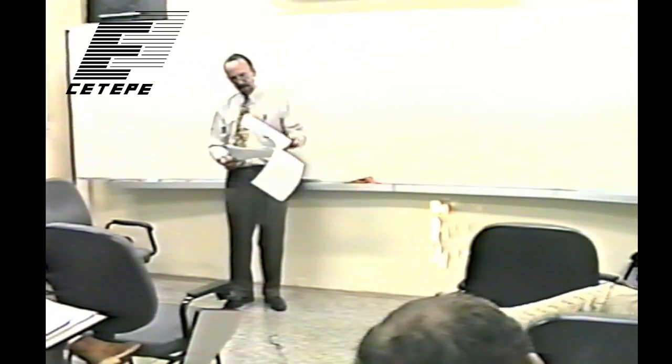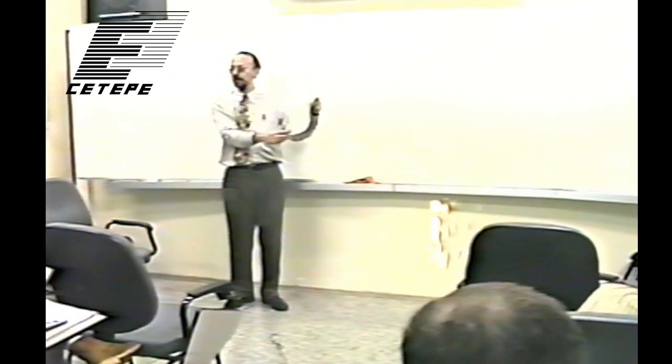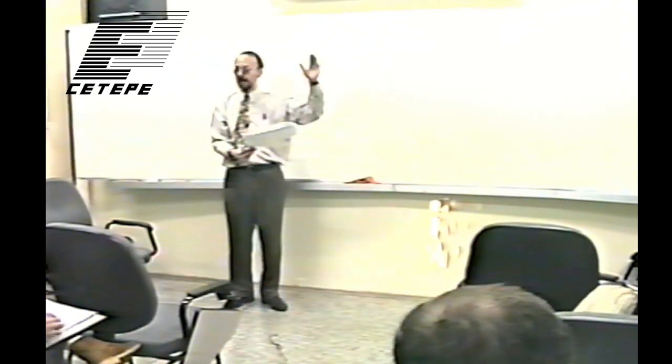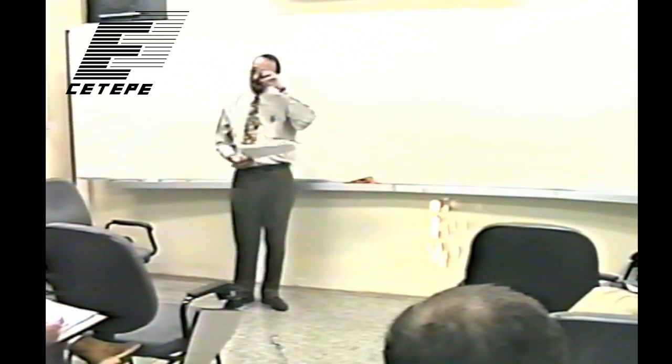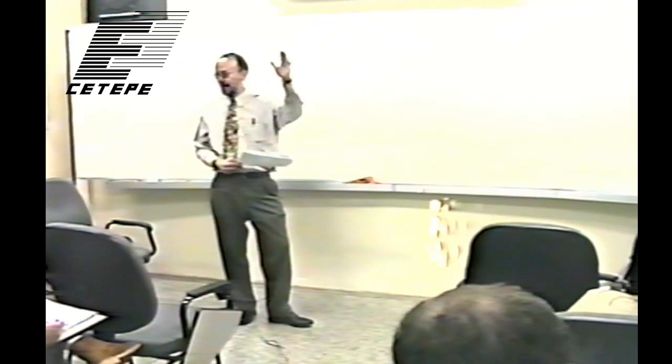But someone asked me, I guess I'll finish going through this handout, just an overview of what's there. And then basically I cut it short after a discussion of the focal spot, so there's a little discussion of the Heel effect and the angled anode, and what effect that has. The source size equals the sine of the anode angle times the height of the electron impacted area.